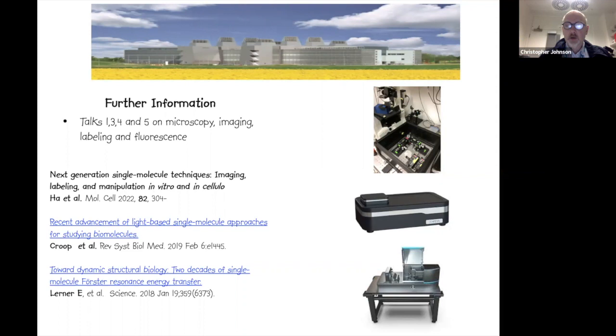The real contrast between the two techniques is that the concentration window that you have with iSCAT is limited to roughly 100 nanomolar of particles or events, if you want to call them. So whatever your predominant molecular species is, be it monomer, dimer, or tetramer, you need to have roughly 100 nanomolar of those particles. That's roughly the upper limit. And this translates to a somewhat more limited protein concentration. In the case of SEC-MALS, the dynamic range of those measurements is almost unlimited, particularly if you use refractive index as your concentration source.